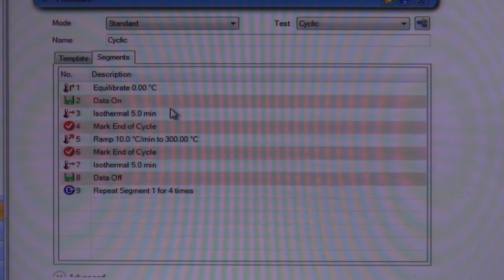When you're not controlling that, everything becomes very complicated. So typically, as is done here, basically as you go into your quenching step, which is the equilibrate function, you're basically switching your recording off. So the only thing that you should see here is 5 heating cycles, and that's it.